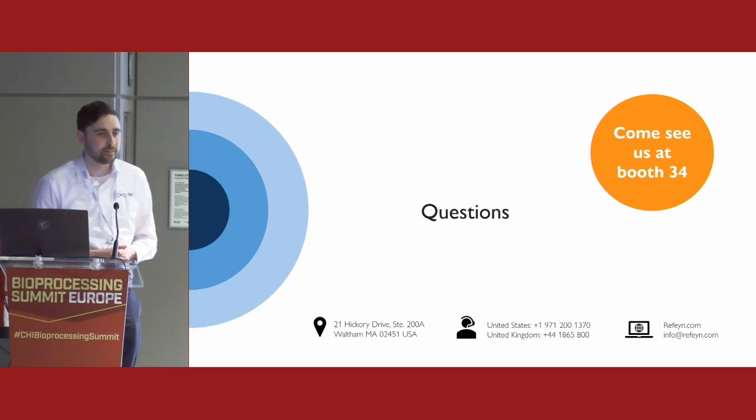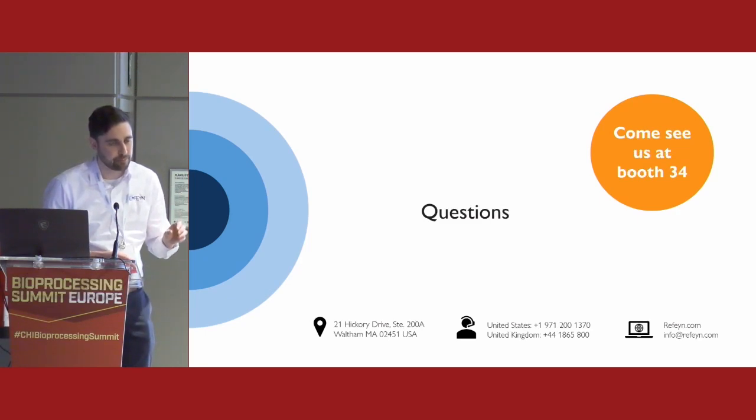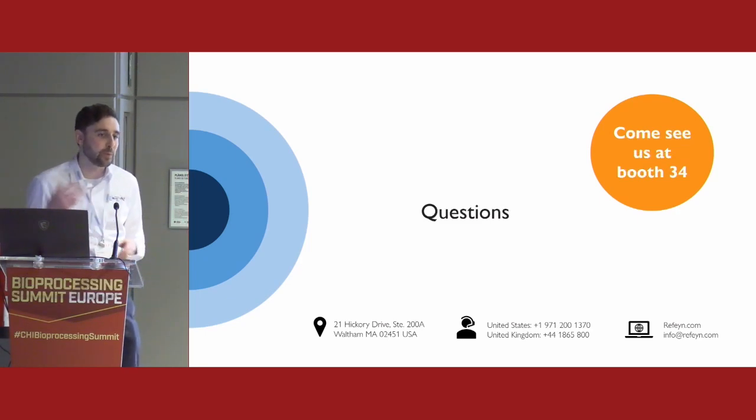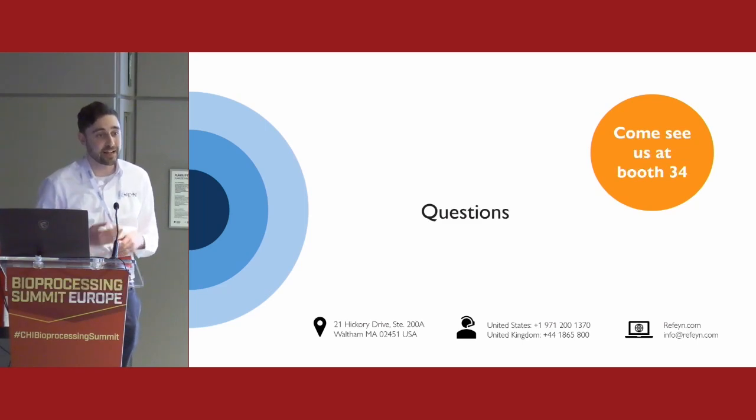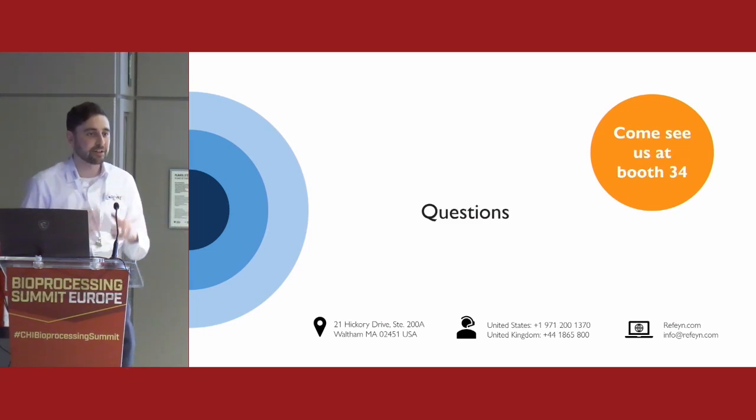I'm curious, you say you measure the mass in solution. What about if the aggregates have already formed particulate? Are you able to measure the size of the particulate, or do I have to dissolve it in a certain way? Are you talking about larger aggregates? Yes, like particles. So you'd have to use a different technology for that. Generally, where people are using mass photometry, it's for looking up to tetramer, pentamer, rather than very large aggregates, which you might look at.